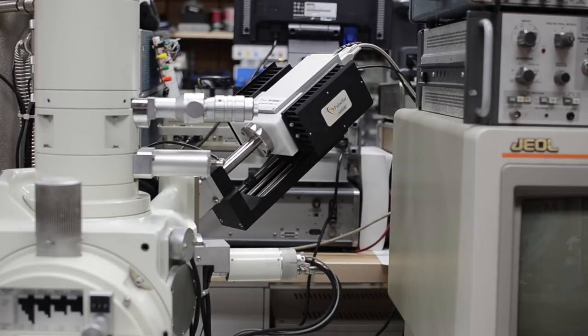Hi. Today I want to talk about EDS, or Energy Dispersive Spectroscopy. EDS is a way of getting information about the composition of a sample when looking at it under an electron microscope, rather than just getting an image of that sample. I'll do a little bit of theory first, and if you're not bored by the point that I finish that, then stick around for an actual demo of this spectrometer here working on my microscope.